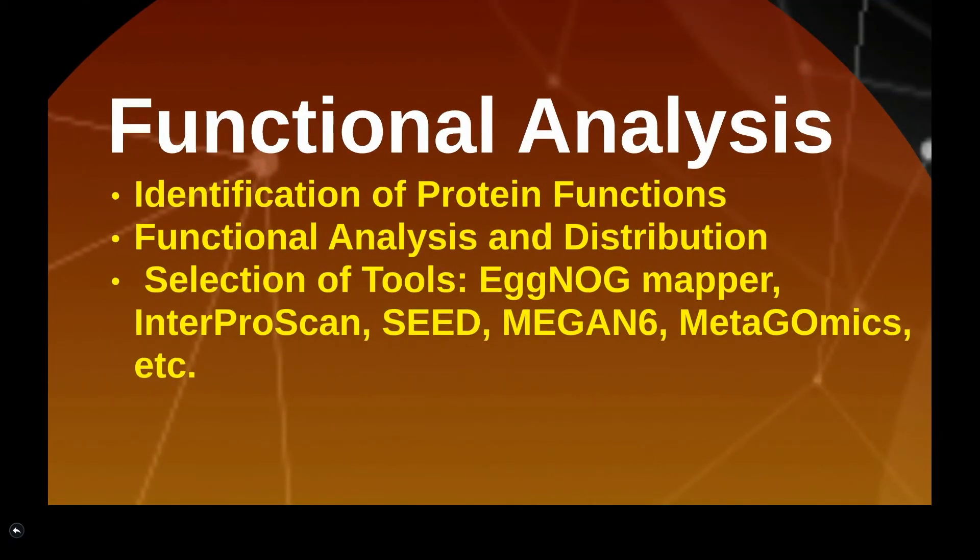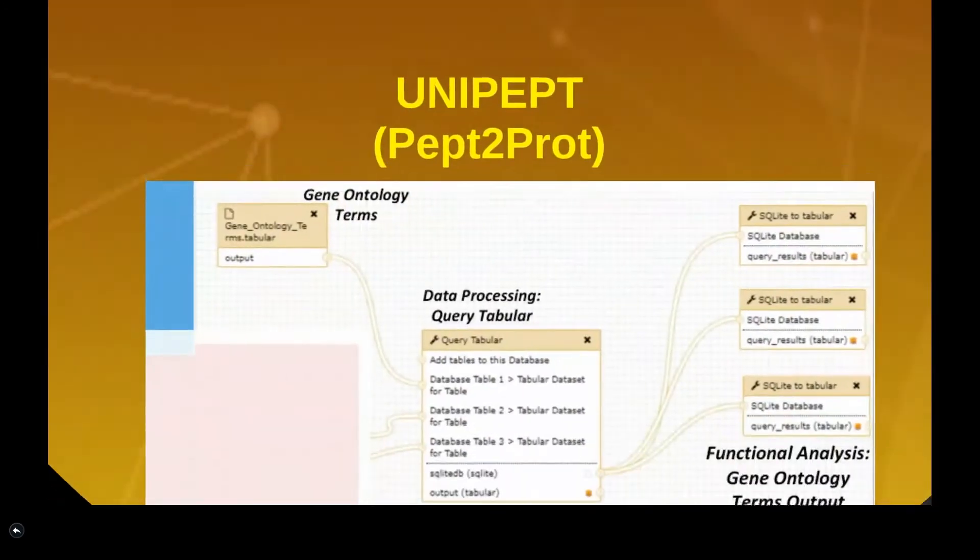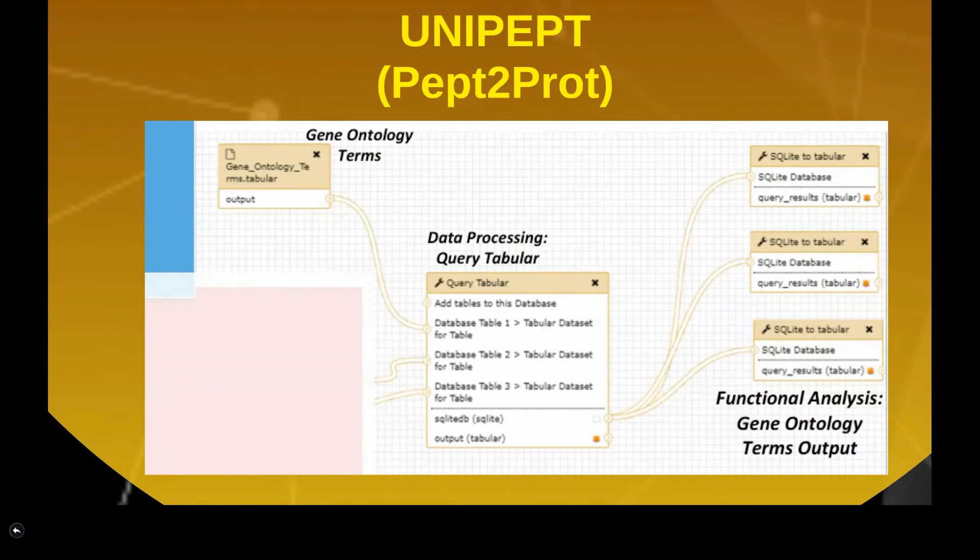The next step is functional analysis. Although there are many tools for functional annotation and visualization, our community-based efforts concentrated on utilizing the UNIPEPT tool and its pept2prot function, which maps identified peptide sequences to proteins.